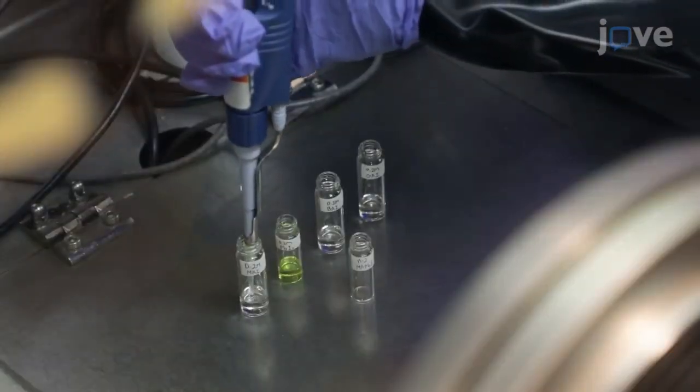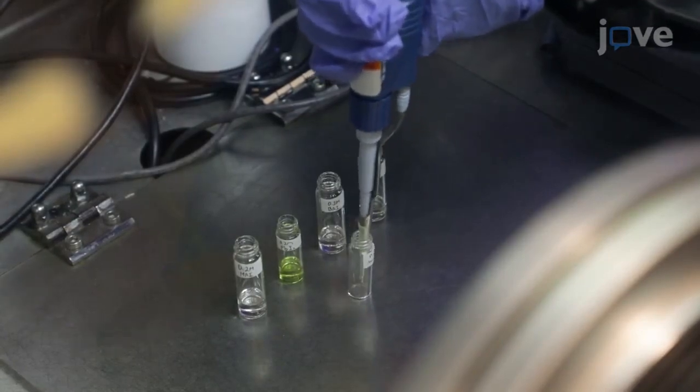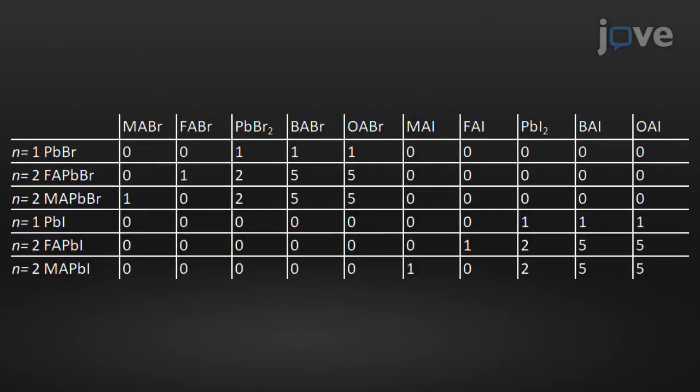To synthesize N=2 methyl ammonium lead iodide nanoplatelets, mix individual 1 milliliter volumes of the indicated 0.2 molar precursor solutions according to the table.